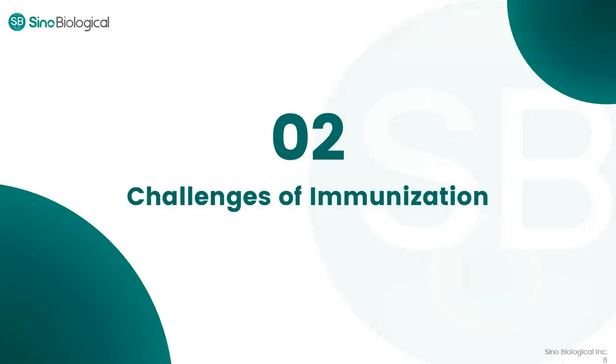As I mentioned before, immunization consists of multiple steps crucial for successful antibody development. So as the start of the whole process, the strategy of choosing immunization procedures will determine the following steps. So we'll discuss more about this step.